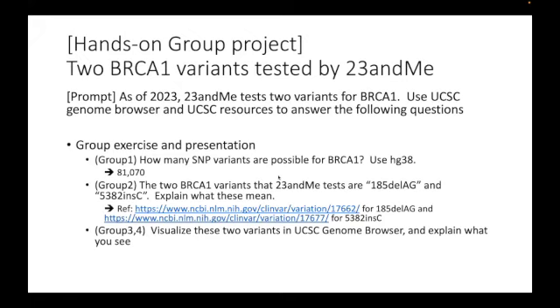DNA sequences? Yeah. SNP chip is like ChIP-seq, like how in ChIP-seq we sequence particular proteins. And here they have a panel of SNPs which are correlated to some diseases, and they are just extracting those SNPs and sequencing that. So it's not whole genome sequencing, but specific bases they are sequencing to see the variants and then predict what diseases could happen. Good try, but actually it's not. That's why I will explain here.